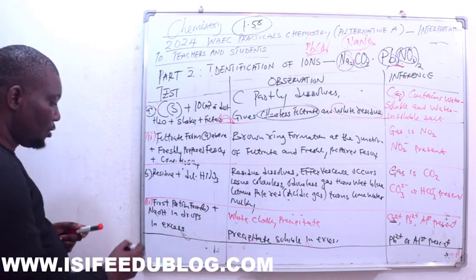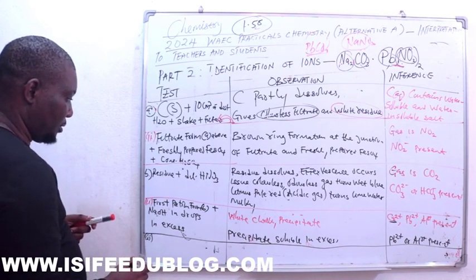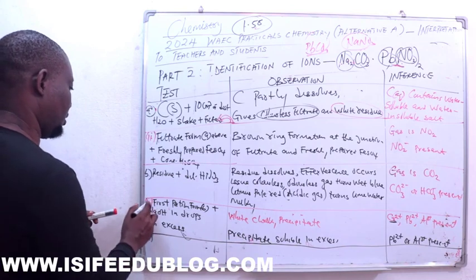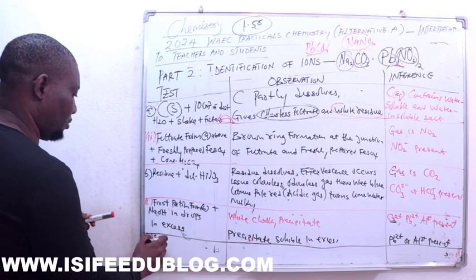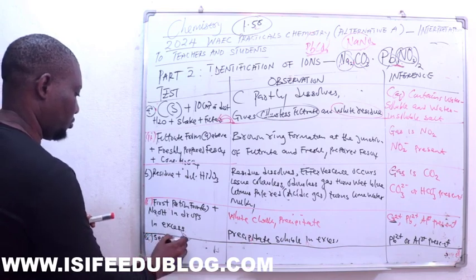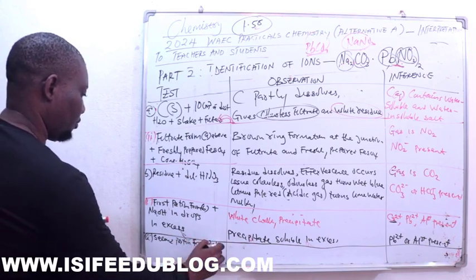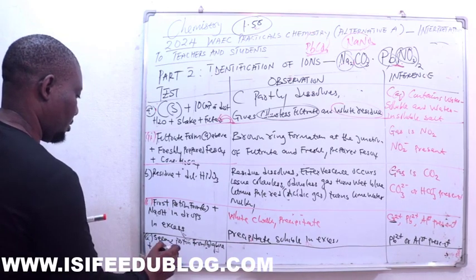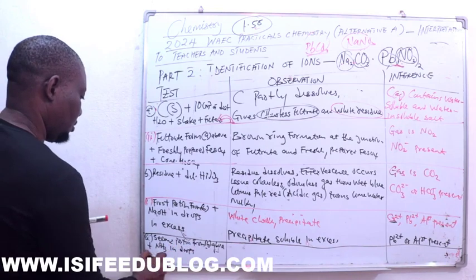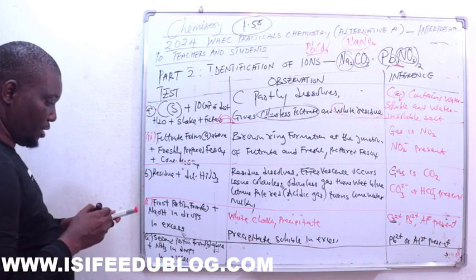So for the next, it is going to be II. This one is the second portion from B above, plus NH3 in drops, then in excess. What are you going to have here?